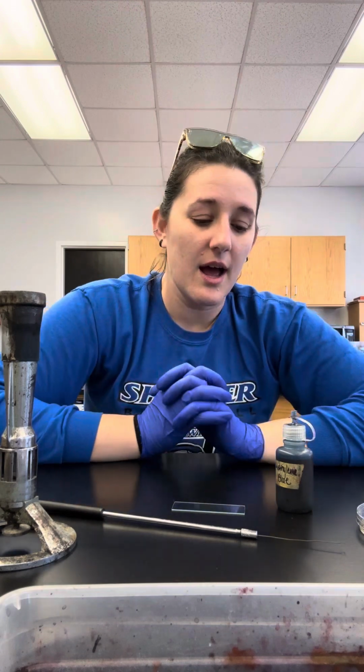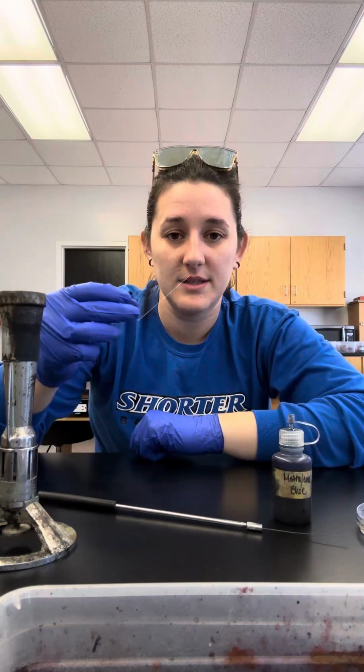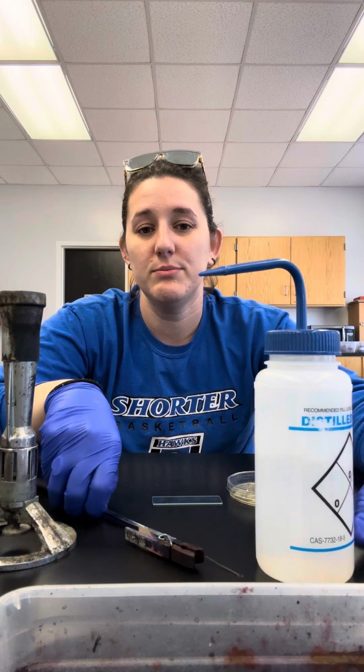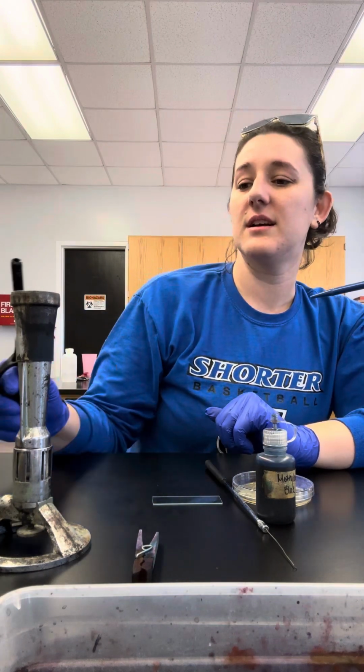Tuesday, Thursday. All right, so simple staining. What you'll need is your methylene blue, a slide, your pen, your loop, your bacteria, and your water. There we are. And of course our Bunsen burner, but I feel like that goes without saying. All right, there's the gas.